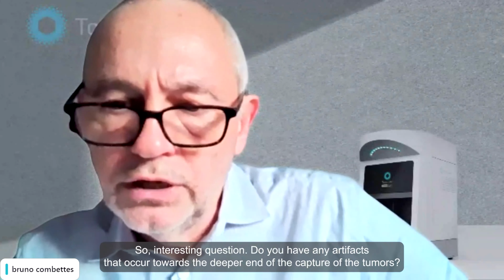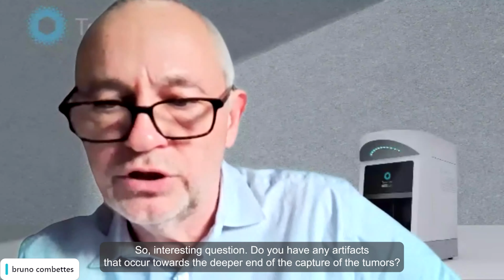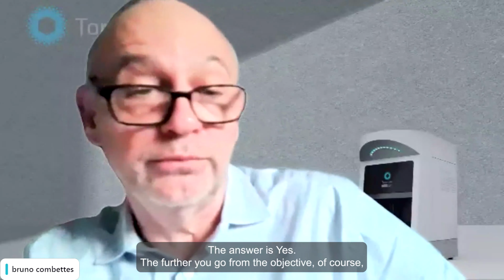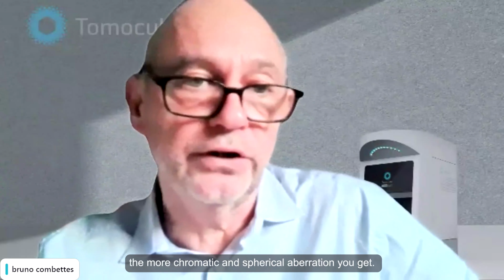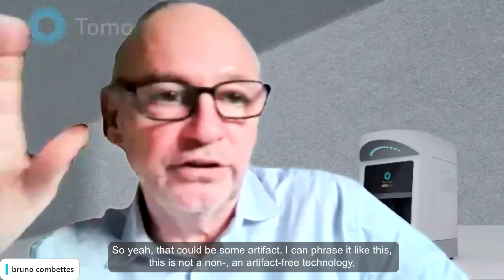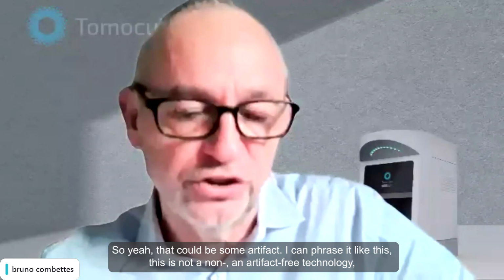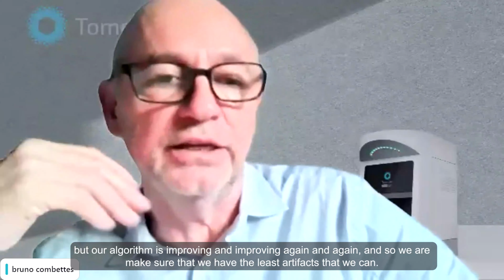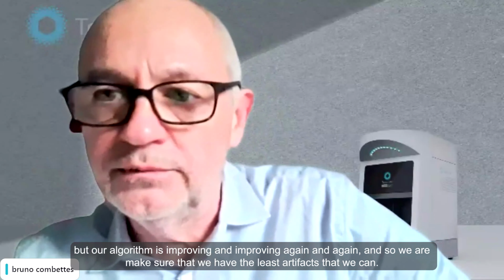Interesting question. Do you have any artifacts that occur towards the deeper end of the capture of the tumors? The answer is yes. The further you go from the objective, of course, the more, let's say, chromatic and spherical aberration you get. So yeah, that could be some artifacts. I can phrase it like this: this is not artifact-free technology, but our algorithm is improving and improving again and again, and so we make sure that we have as few artifacts as we can.